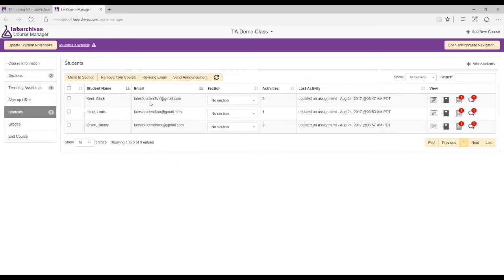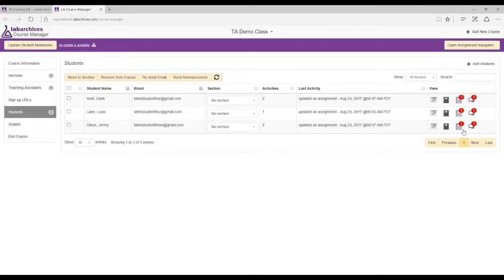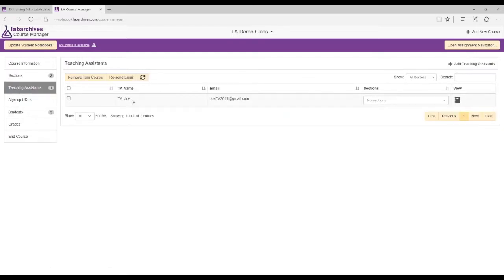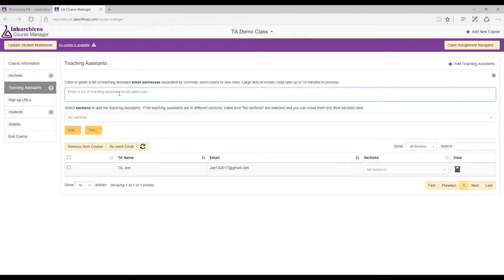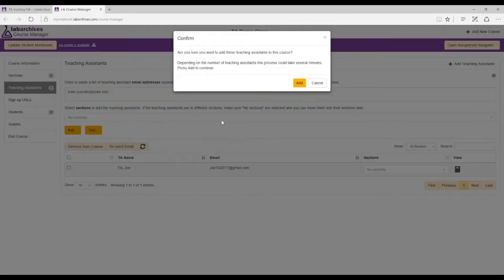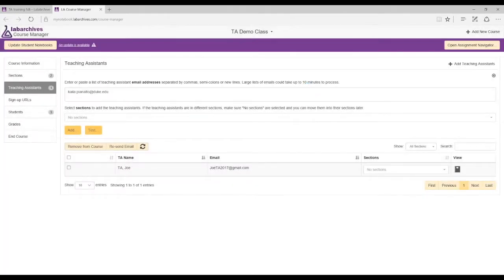On the screen you can see I've added three students and they've done some homework — I get notifications about that as the instructor. My current TA is Joe TA, but I'm going to add you as a TA so you can see what happens. I'll add your email address and confirm, and yes, I want to add you to this course.